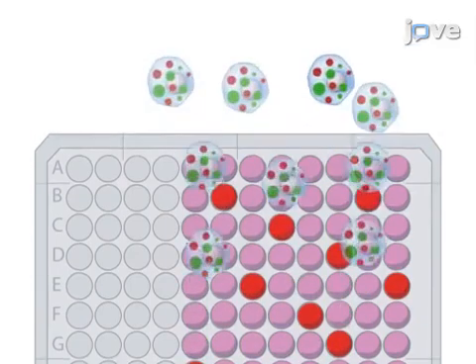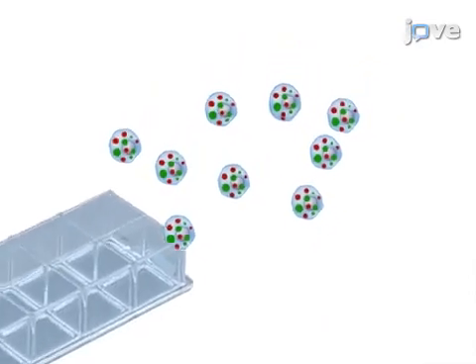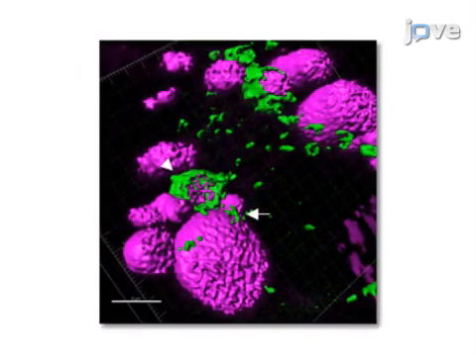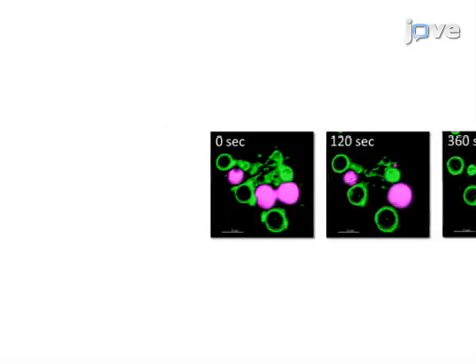Next, the effect of the tested gene on mast cell secretory granule generation and development is assessed by confocal imaging of the reporter gene that is localized to the secretory granules. The final step is to perform morphometric analysis of the secretory granules. Ultimately, fluorescence labeling of mast cell secretory granules using a reporter gene is used to show alteration in mast cells' secretory granule development and their exocytosis.